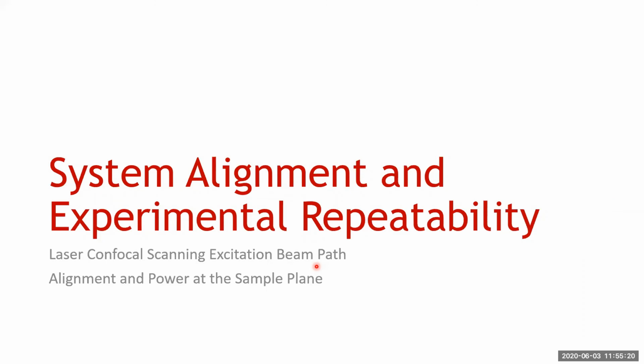So if I have to process my files on my personal computer, which is not as fancy as our imaging or image processing computers, then if I'm opening my confocal scan in my Zen program, it takes a while. That's completely understandable. We've all been in that situation.